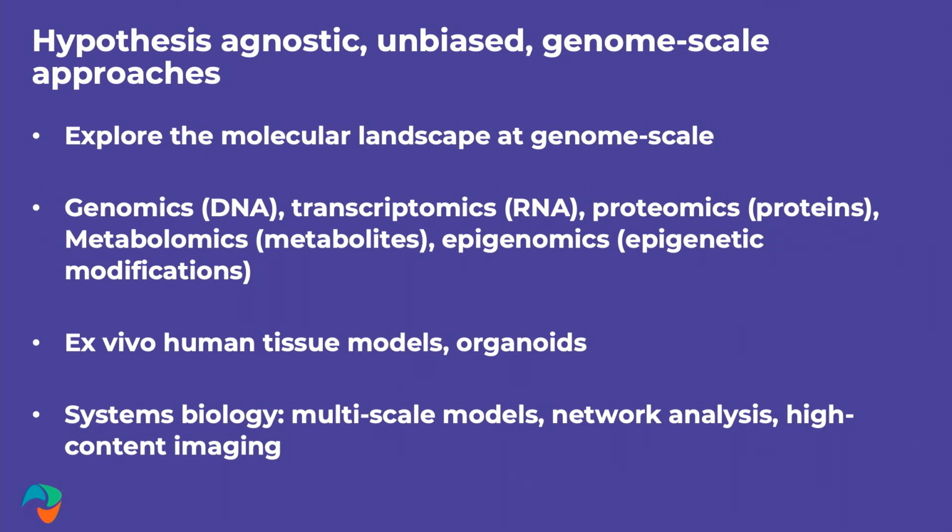Ideal models don't exist, but they could if we got some insight. You can look at a systems approach, multi-scale models, meaning going from molecules through organelles, through cell biology to tissue. You can do network analysis, which is mathematical analysis of the interactions of all the biochemical pathways that are affecting lipedema. And you could do something called high-content imaging. I'm going to talk to you about high-content imaging today.